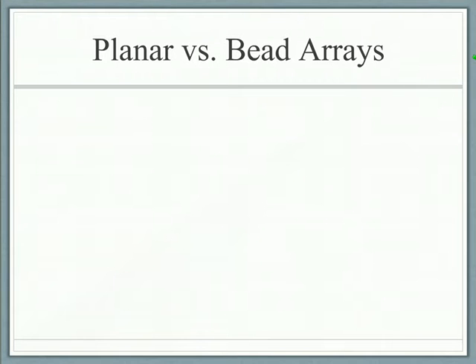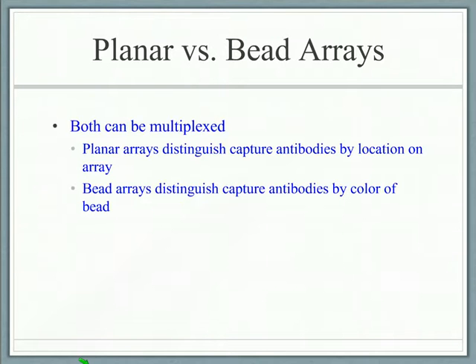In a lot of ways they're very similar. I'm going to focus on the planar arrays because that's the format used in my laboratory, although we have some familiarity with the bead arrays. So both of them have the ability to multiplex. They use a different principle for the multiplexing. The planar assays have different capture antibodies on different locations on the array by which their different assays are distinguished.